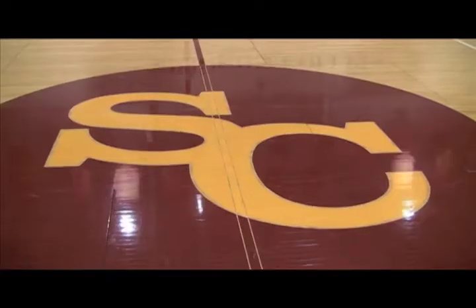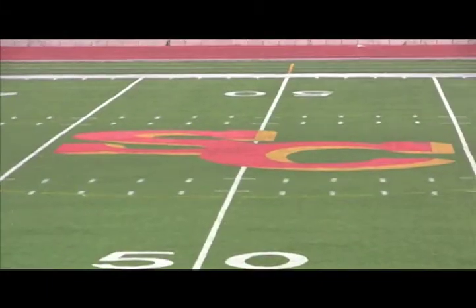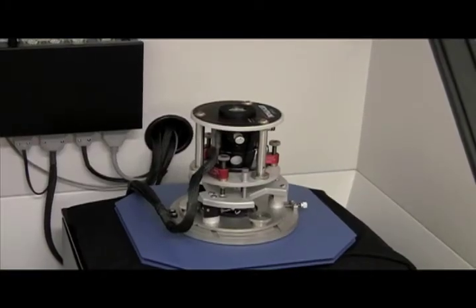The Simpson College logo can be seen all across campus, but there's one logo that can't be seen with the naked eye. Using Simpson's new atomic force microscope, chemistry professor Ron Warnett was able to create the smallest imaginable logo, one that up until this year would have been impossible to see here on campus.